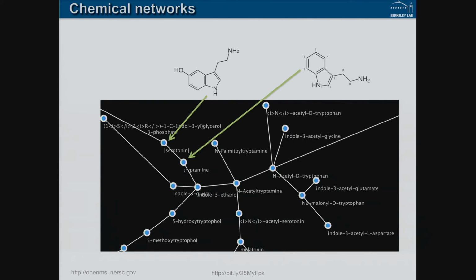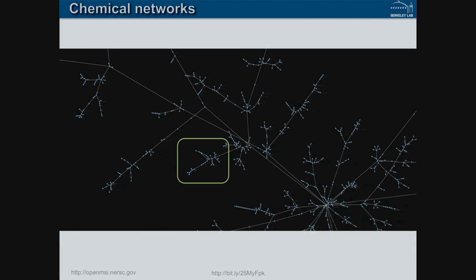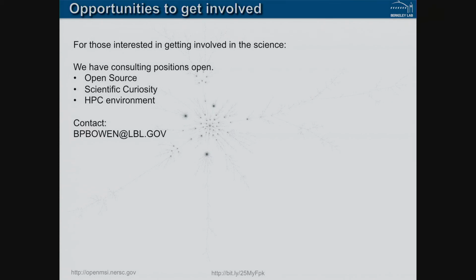So this is an important tool, and when you start pasting all of biochemistry on tools like this, you generate very large trees, which you can't quite see here because it's so minuscule, tiny. But the point is you can now start to paste data onto these graphs and help understand the context of one result in the context of something you understand.